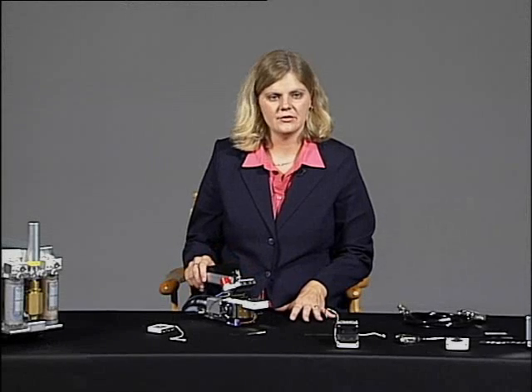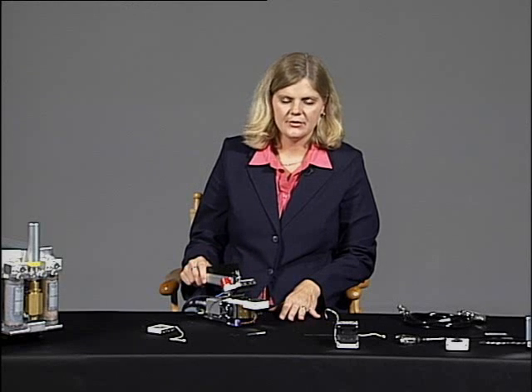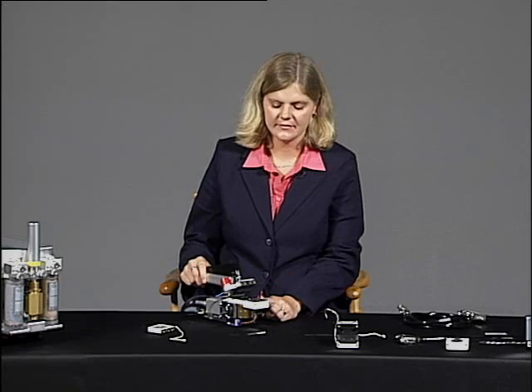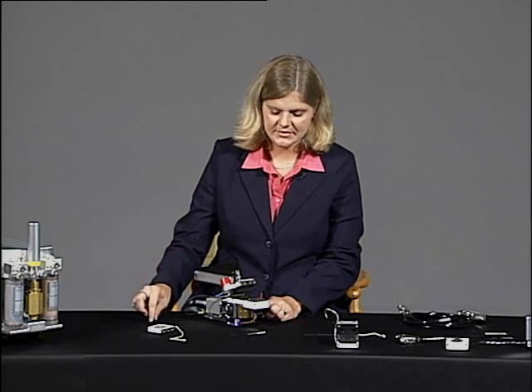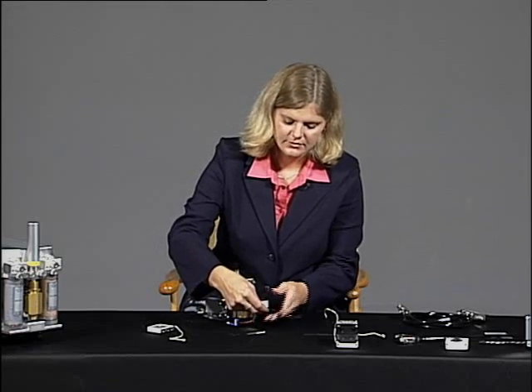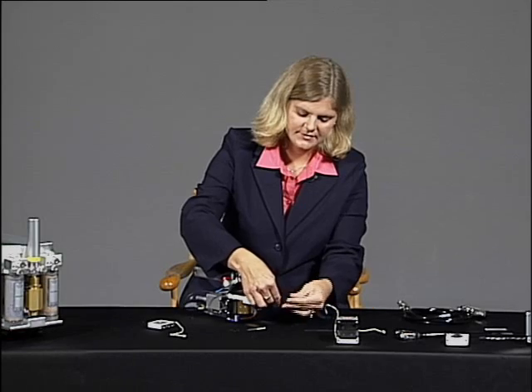When you're using your leaf chamber fluorometer, the 6400-40, you also need to remove the bottom chamber in order to install this chamber. So I'll demonstrate how to do that now. First, loosen the hex screws that hold the bottom chamber in place.